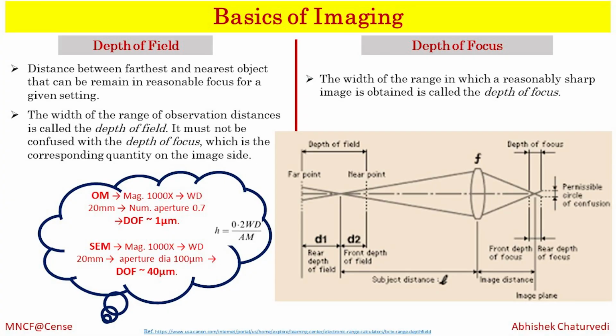So it's a huge difference when you are talking about a microstructure or fracture surface, or for those working with MEMS devices, where you have a situation where one end is a valley and the other end is a peak. Again, you have depth of focus: in one case we are changing the object plane, in the other case we are changing the image plane.